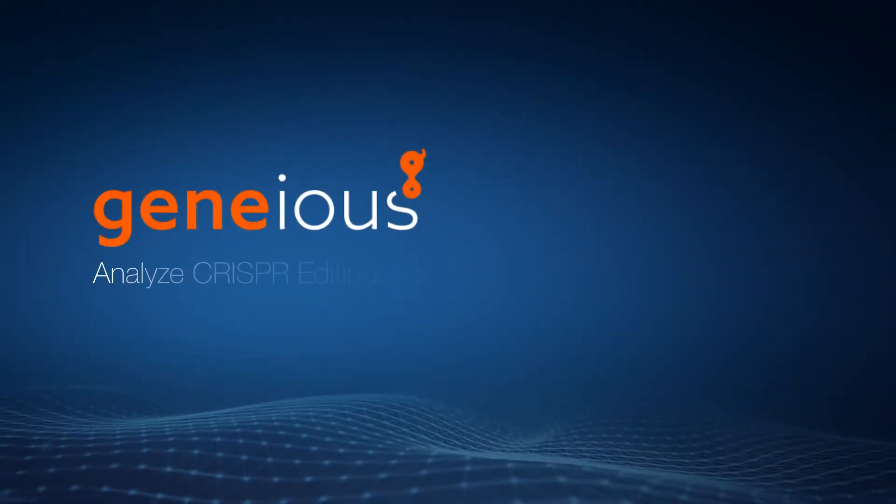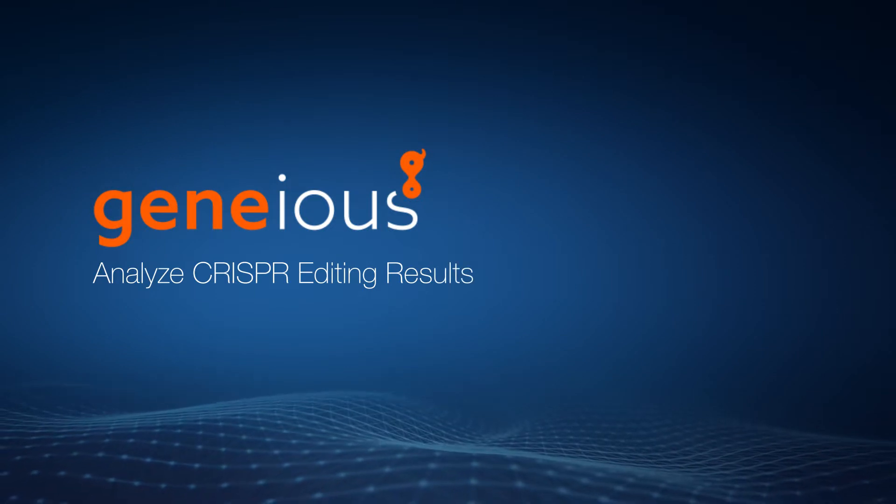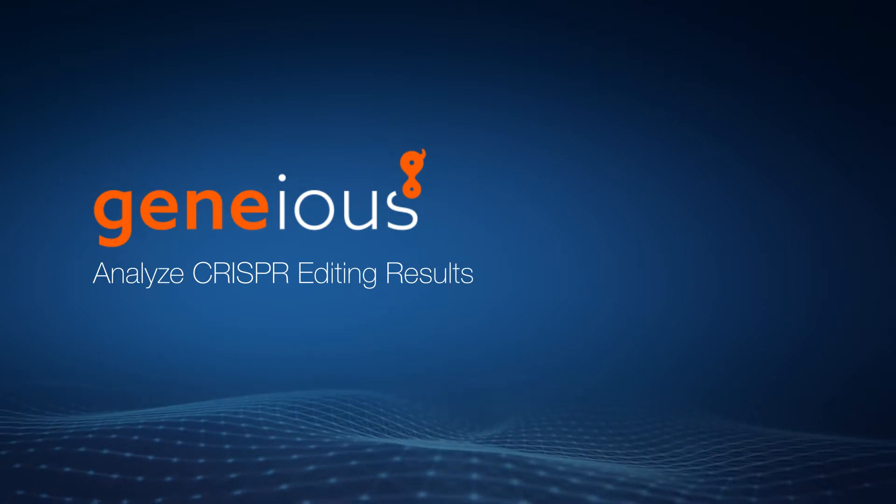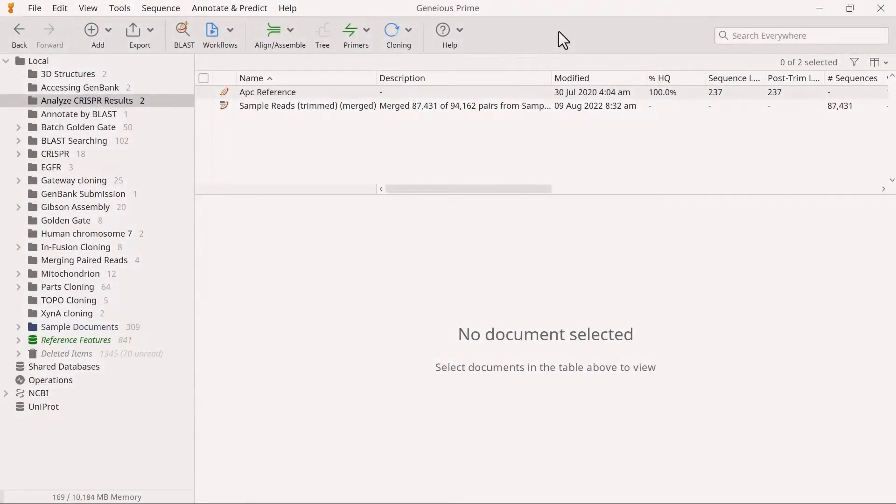Welcome to this video on analyzing CRISPR editing results with Geneious Prime. The Analyze CRISPR editing results tool uses unaligned Illumina sequencing reads from imported FASTQ files.